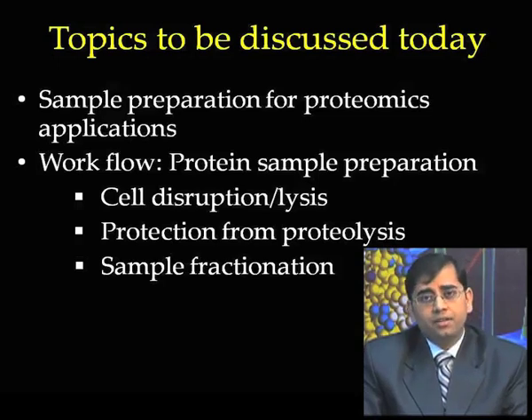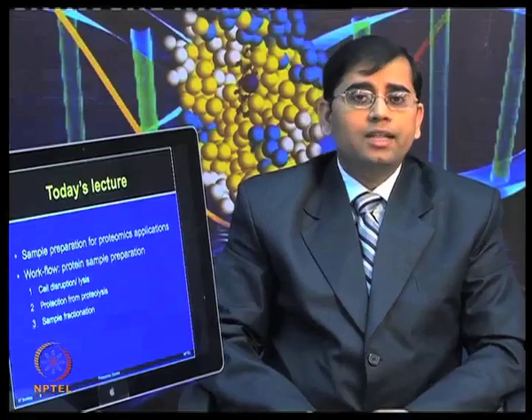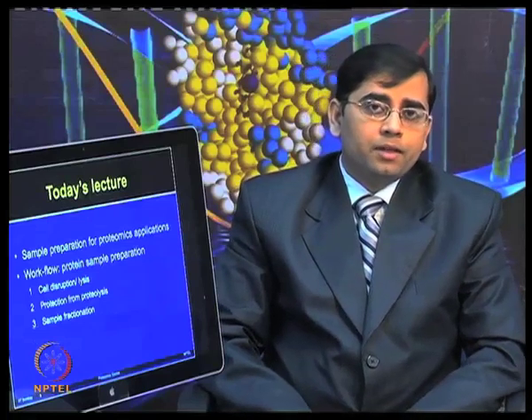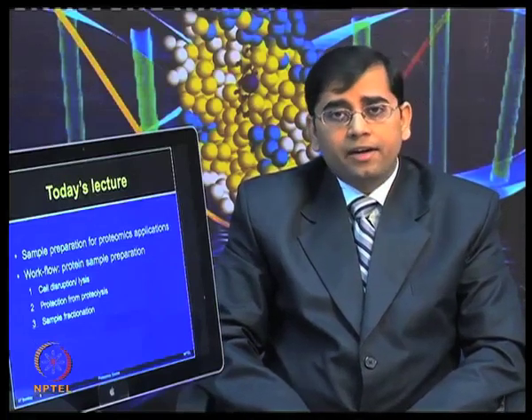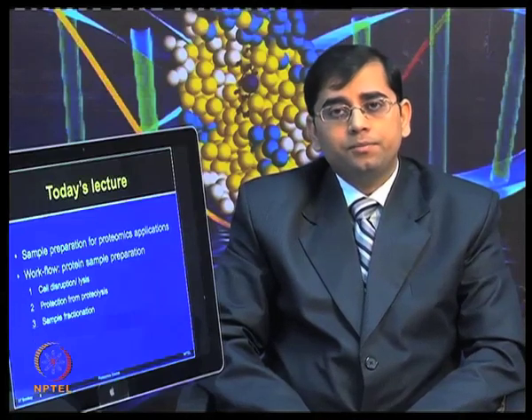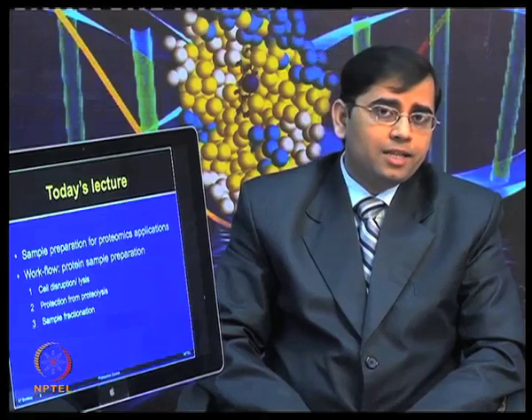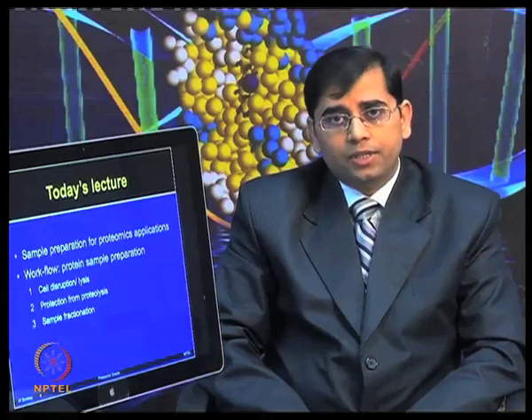Protein extraction and solubilization are another very essential component. Now, when we are talking about sample preparation, this is quite generic for different types of proteomic application, whether one wants to use gel based approaches or gel free approaches.